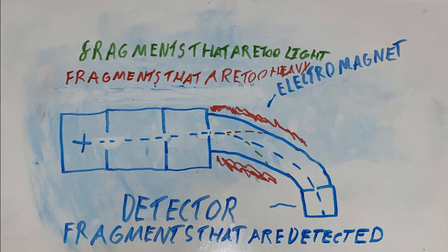When an ion hits the detector, its positive charge is neutralized by an electron moving from the detector into the ion. This causes the electrons in the metal wire of the detector to flow up to fill the positive electron hole generated by this electron leaving. This results in an electric current being generated, which can be amplified and recorded. The more ions arriving, the greater the current, so the greater the intensity of the peak.